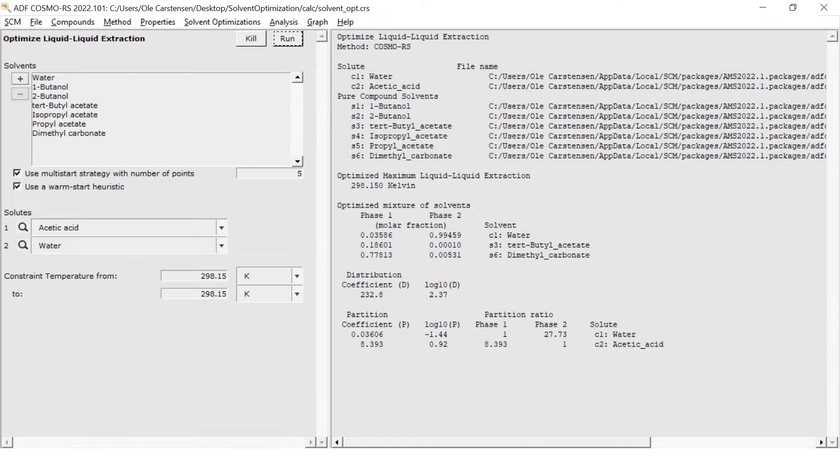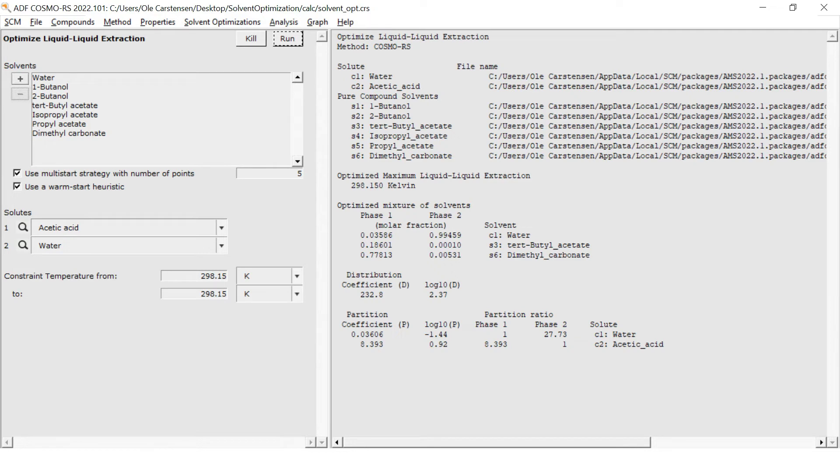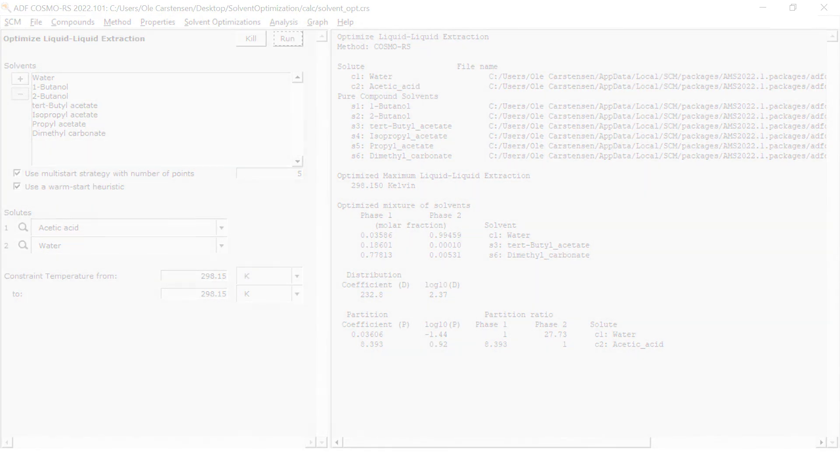This solvent system provides a good value for a separation with the distribution coefficient D of 32.8, but it is still worse than the distribution coefficient of the initial water-hexane solvent system by roughly a factor of 6.